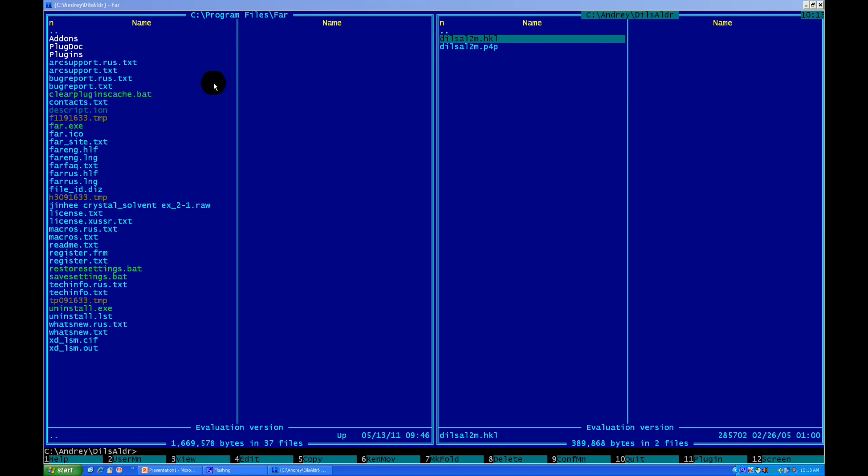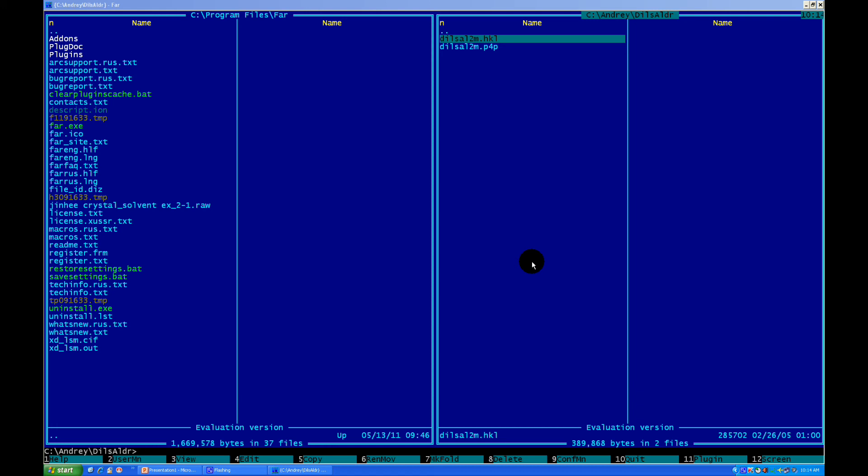Now let's work with our files, finally. First thing, you need to make sure that both of your files have the same name, of course different extension. I mean, hkl and p4p file have the same name. It's very important, because if you don't do that, then the command line will not recognize both files and it won't read both of your files. Make sure that they have the same name and different extension.